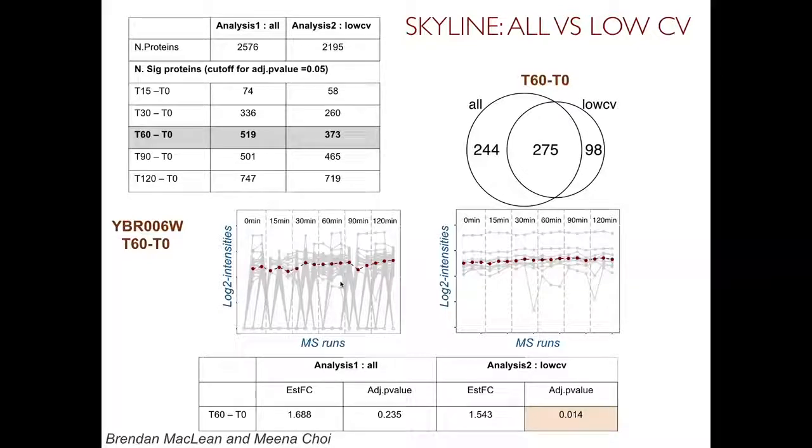But here's another thing that happened, and this is something that Alexei and Brandon already talked about. If you see here, we lost one replicate here. So in this particular case, time point 0, when you have so many features, you also have to be a little bit more conservative with false discovery rate, and so the Q-value cutoff actually ended up losing one replicate in addition to introducing more variability. So in this case, after cleanup, we can probably say that the change is plausible here, and so this type of cleanup definitely is beneficial.